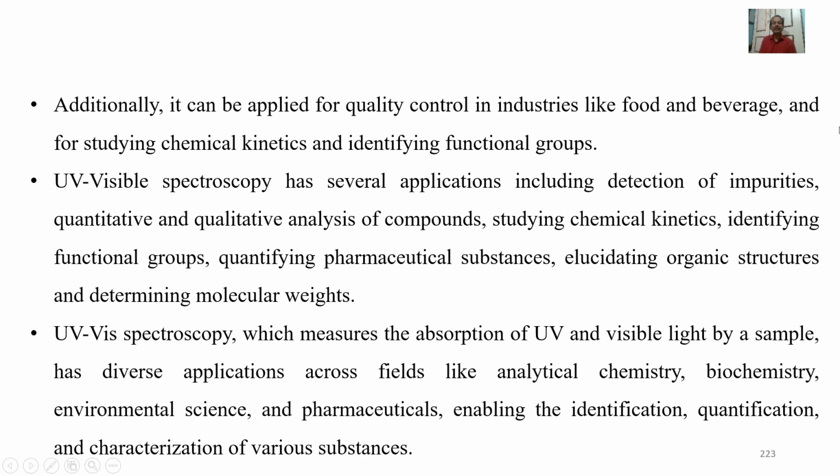identifying functional groups. UV visible spectroscopy has several applications, including detection of impurities, quantitative and qualitative analysis of compounds, studying chemical kinetics, identifying functional groups, quantifying pharmaceutical substances, elucidating organic structures, and determining molecular weights.